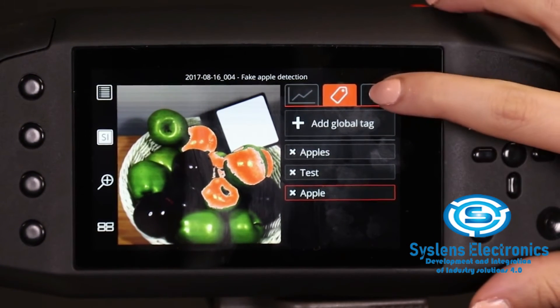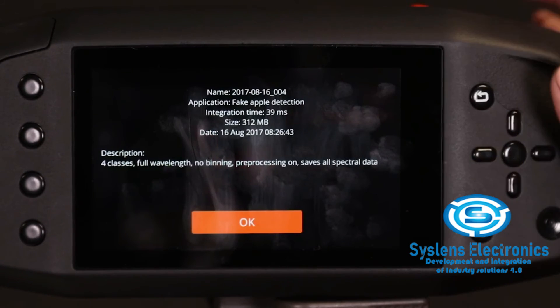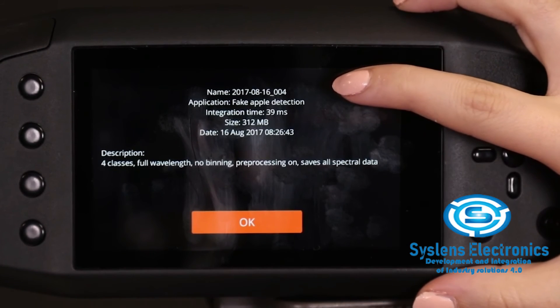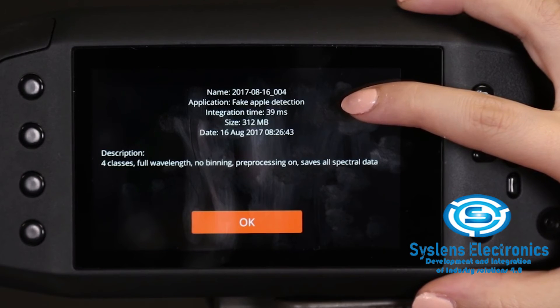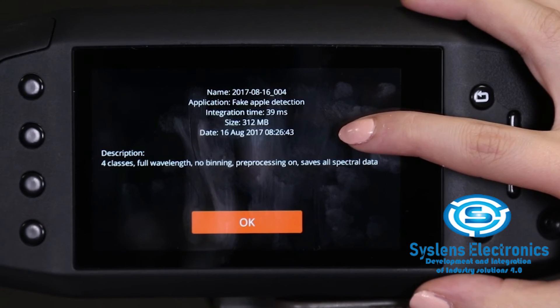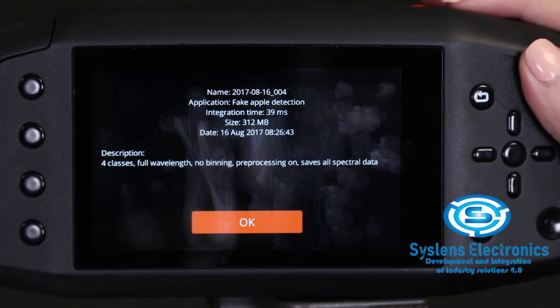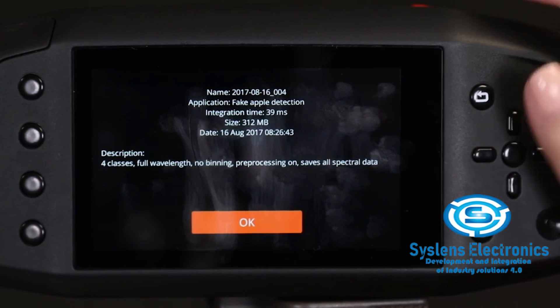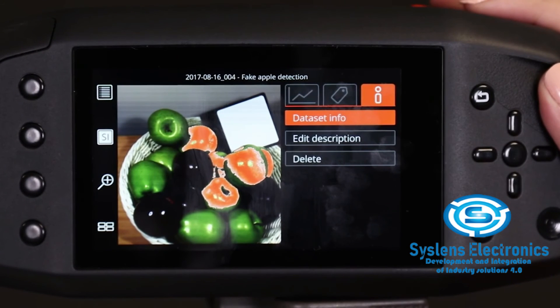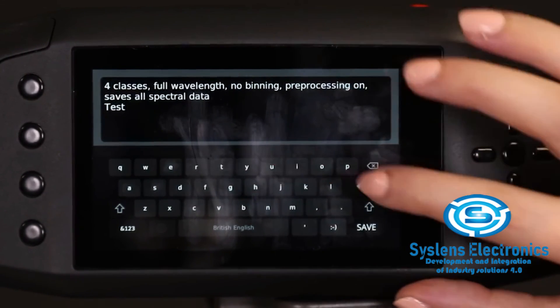On the info tab, you can review some of the dataset details, edit the description text, and delete the dataset from the catalog. Tap the dataset info on the right side of the screen to view the following details: the dataset name, the data recording mode or the name of the application used to capture the data, the integration time, the size of the dataset, the recording date and time, and a description of the dataset. If you have recorded data with an application, the text will be shown as defined in the application creator in the SPECIM iQ software. Press OK to close the window. You can edit the description by tapping the Edit Description button, make the desired changes, and press save.